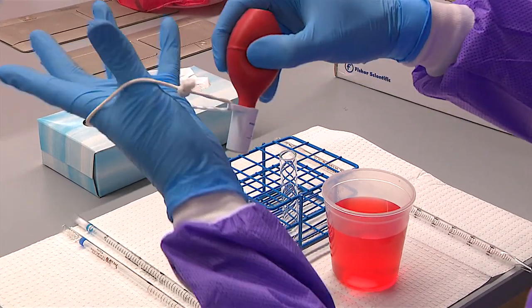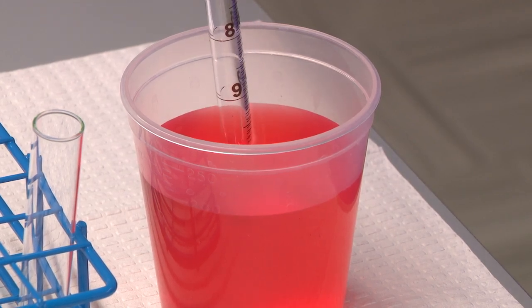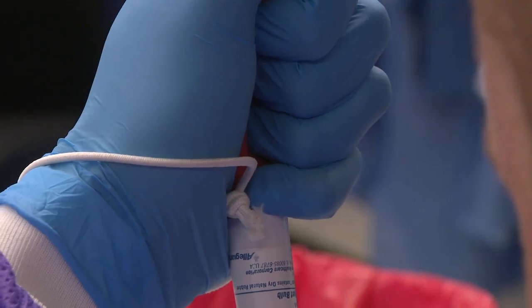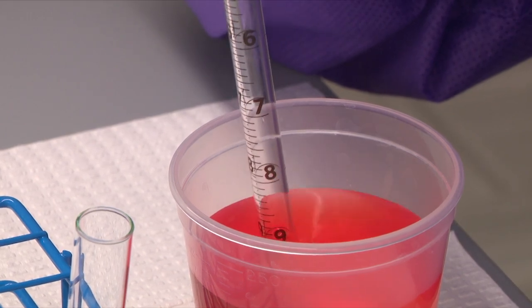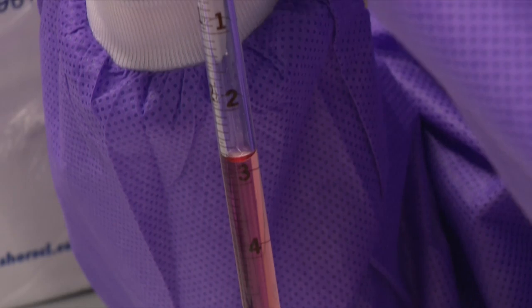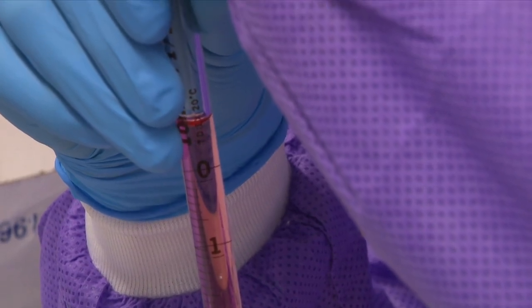We are going to fill our pipette by taking the safety bulb and squeezing it to expel the air. Holding the pipette vertically with the tip of the pipette immersed in the water, we will then place the bulb on the top of our pipette. Make sure to keep the safety bulb in the squeezed position. Gently release your grip on the safety bulb and allow the water to be aspirated up the pipette until the water is approximately 1 to 2 inches above the calibration mark or the 0 mark. Do not aspirate any water into the safety bulb, but if you do, stop and get a replacement bulb.